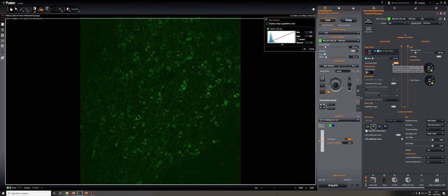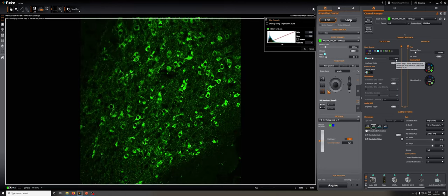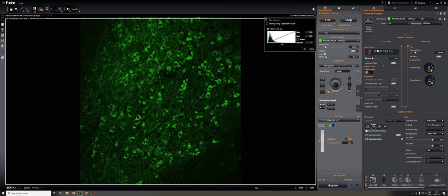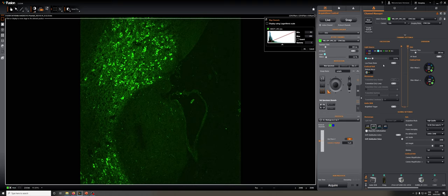Be careful that when you turn this off, it jumps up by a factor of 10. So if you have a relatively high percentage within this range, be careful when you change it while live, because suddenly the laser power can jump up dramatically. For reasons of speed, I recommend that if you have low power mode on one of your channels, you ensure it's on all of the channels, because switching that feature on and off can introduce delays. So either keep it always off or always on across all the channels you're using.